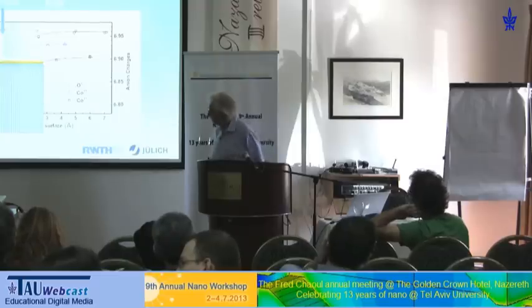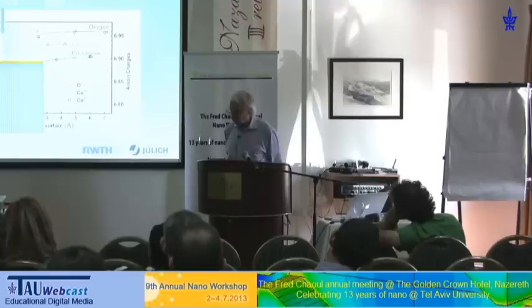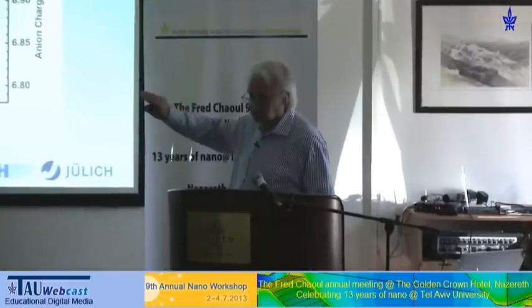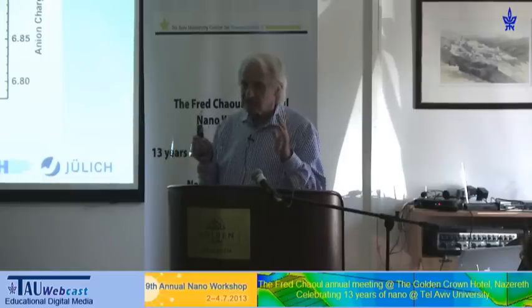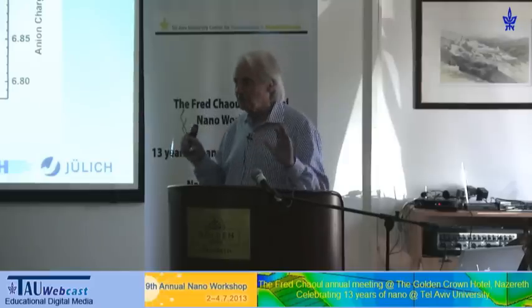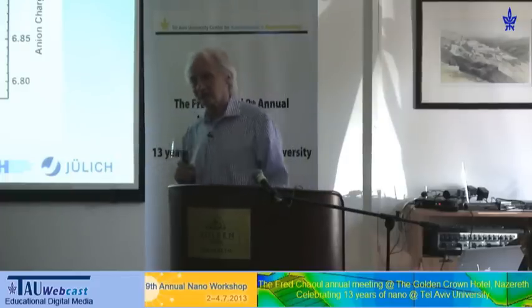I think the thickness of the sample has to be such that, when you have about 15 to 20% of the atoms replaced at these charge numbers we are dealing with, then you can see it. We have done numerical calculations. That means to see a single atom at the moment is not possible. We are at the moment in the middle of work where Junlin Jia, who did much of this work, claimed to me recently that he can see a single atom.